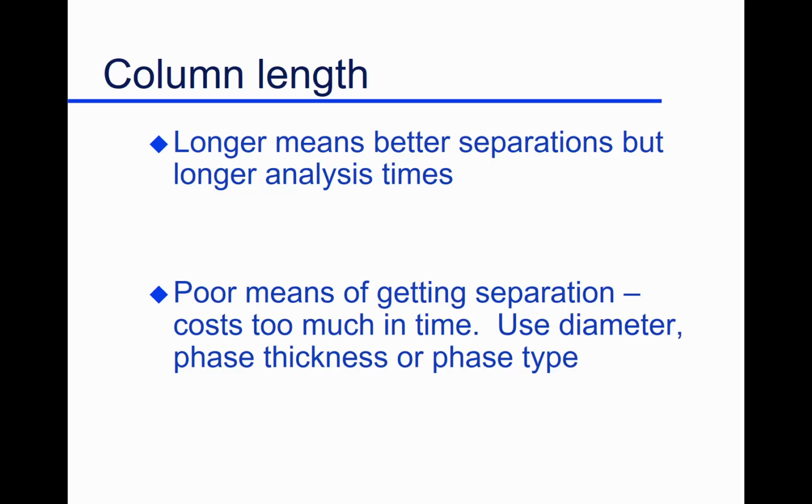And never, ever assume that something you read is the best way to do it. I say that because a lot of times the people that do this kind of work don't really think about these parameters. If they get a separation, they say, well, that's good. But they don't take time to optimize each of these parameters. So again, you take it with a grain of salt and say, well, that's nice, but I think I can do better. So longer means better separations?